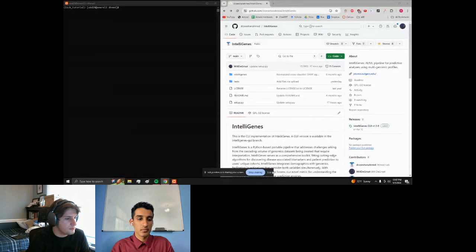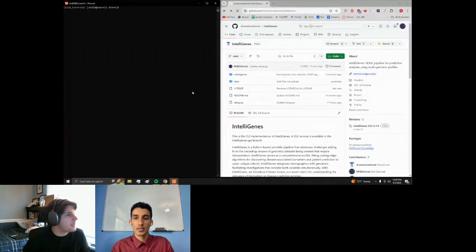Yeah, Rishabh did cover all of the features of the platform itself. I'm just going to go through the command line implementation of IntelliGenes very quickly, show you where to download it and how to do so. So let me share my screen, and we'll go over that now. Is this visible? Yes, it is. Awesome. Thank you.